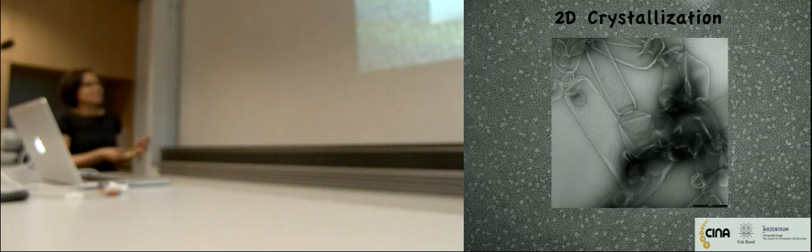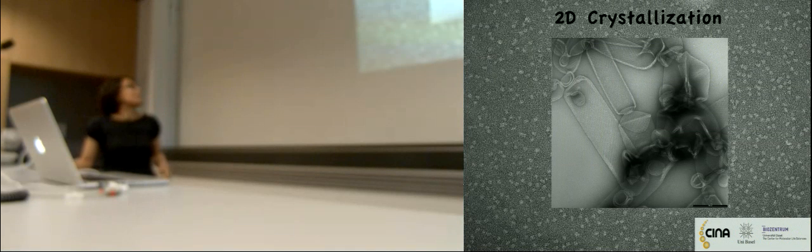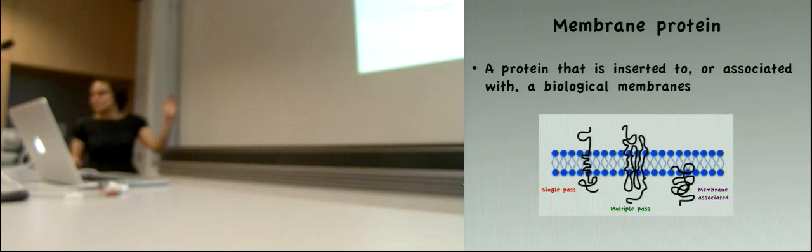I will try to give my talk quite fast. So I'm going to talk about the 2D crystallization. Actually, the first thing is that we are trying to get the 2D crystals of membrane protein.